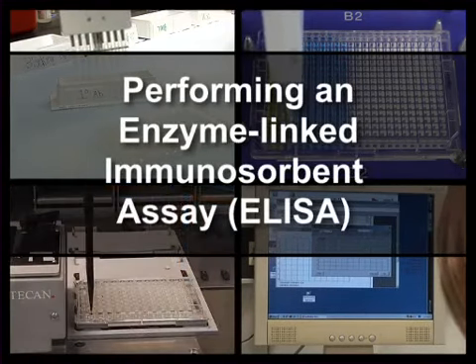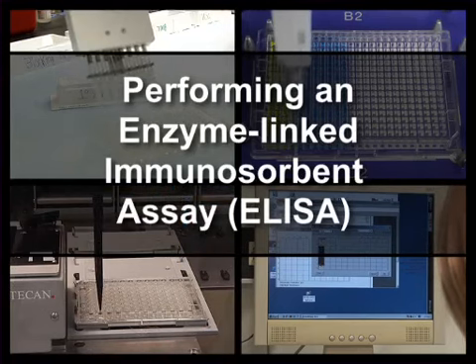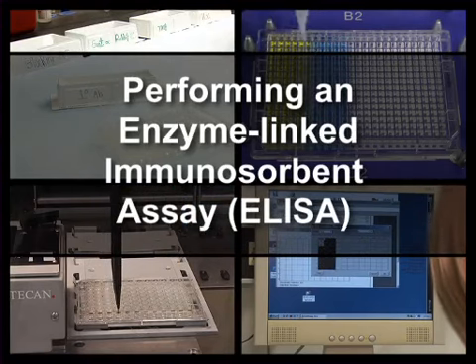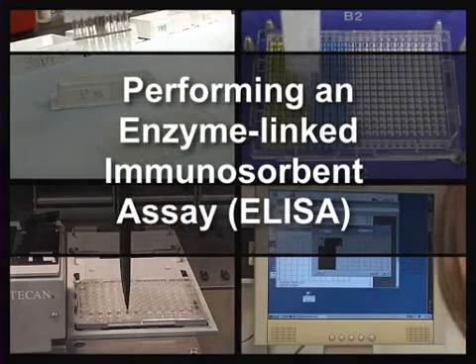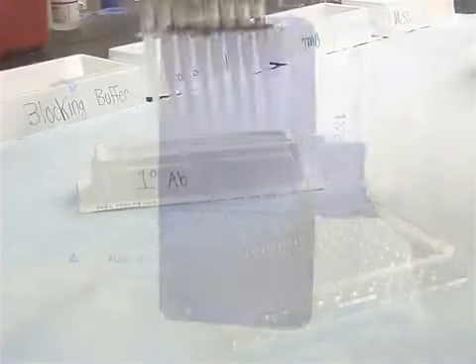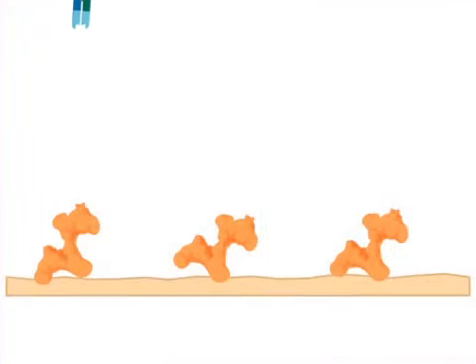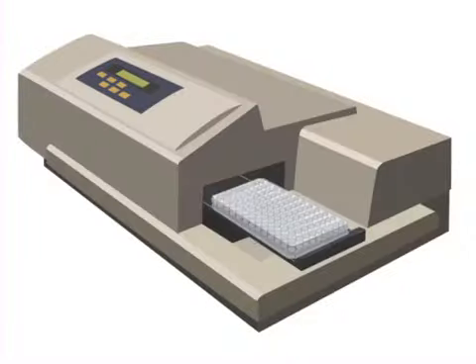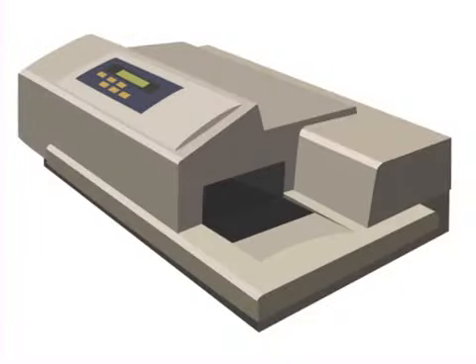The ELISA, or enzyme-linked immunosorbent assay, is a widely used method for determining the presence or absence of a specific target protein. Via a series of washing and binding steps, an antibody conjugated or linked to an enzyme will recognize a target protein at the bottom of a 96-well plate. When substrate is added to the sample, an enzymatic reaction will occur, causing a color change that allows the identification and quantification of the target protein.